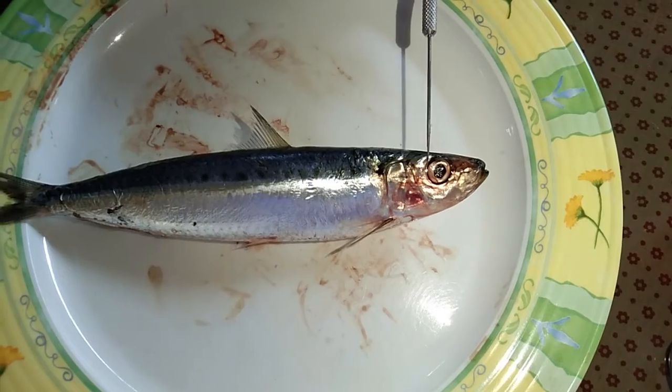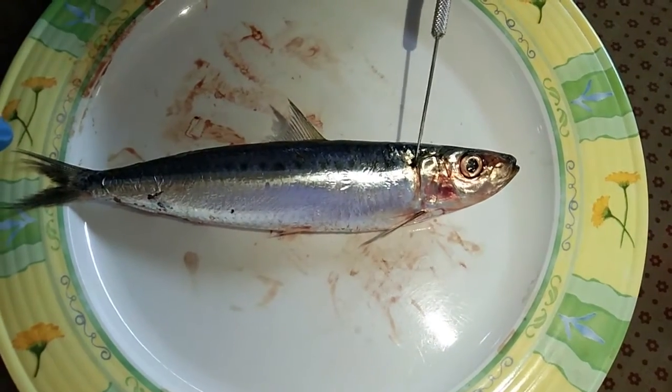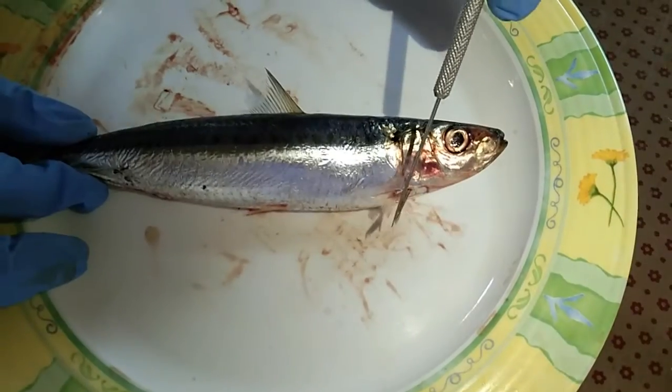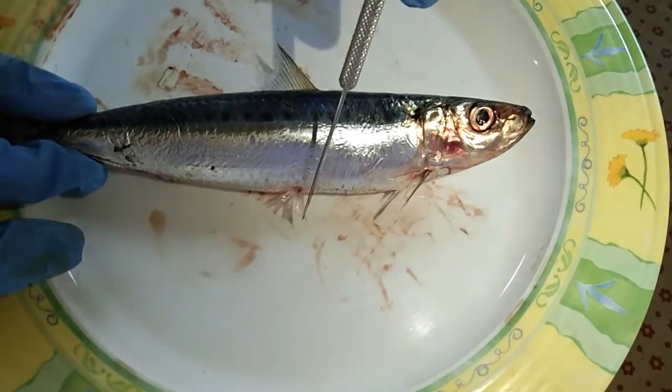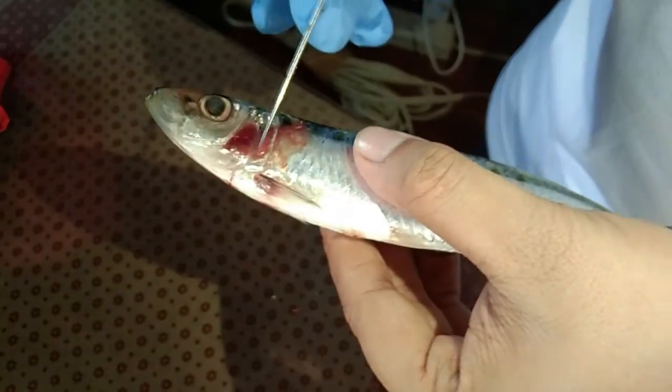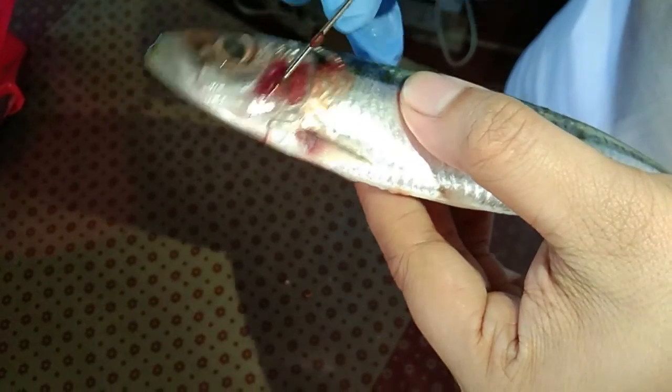Locate the mouth, eyes, the operculum, the blackish macula, the dorsal fin, the pectoral fin, pelvic fin, anal fin, the anus, and the caudal fin. Open the mouth and expose the tongue and locate the striated tooth cap.